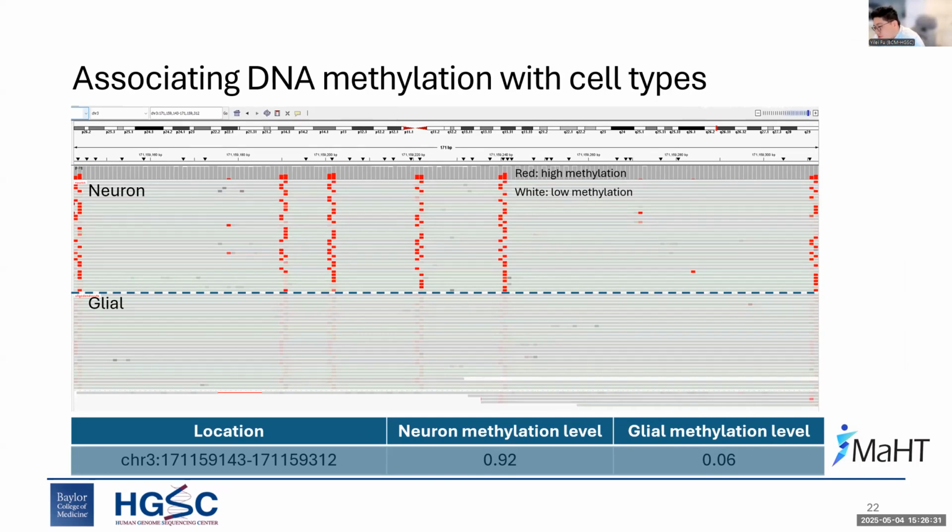Based on that finding, we utilize an EM algorithm to assign the reads to cell types. We show here that we can separate the reads based on their DNA methylation signature in the given regions. With regions that have a larger DNA methylation entropy among the cell types, the EM algorithm can decode more cell types than just these two.